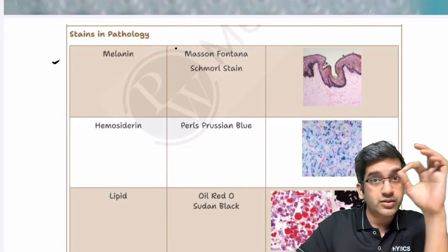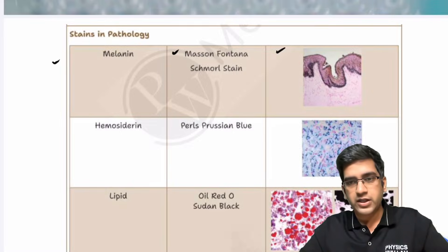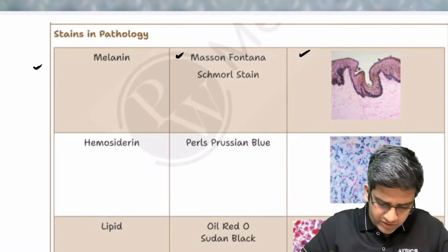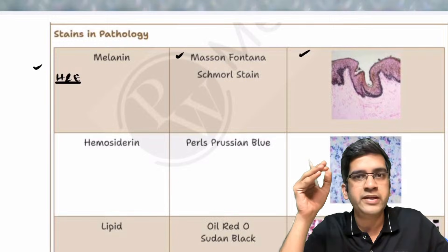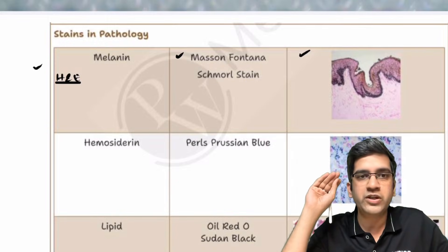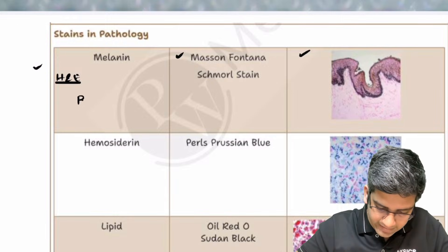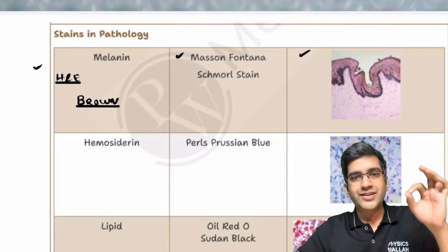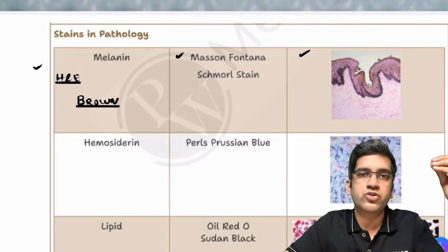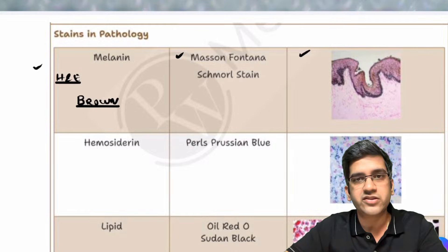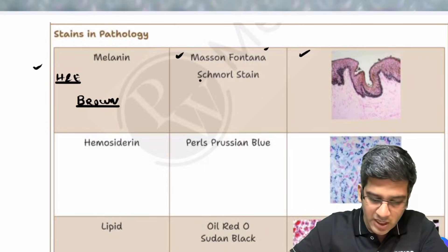I'll show the stain, the image of the stain, and give you one or two use cases. First, what will be the color of each substance in a routine H&E? Let's start with melanin — it's a simple question. Melanin is not black; it is brown. The normal color of melanin is brown. The stain used to identify melanin is Masson-Fontana. Another one is the Schmorl stain, though it's not as commonly used in routine diagnostic pathology.